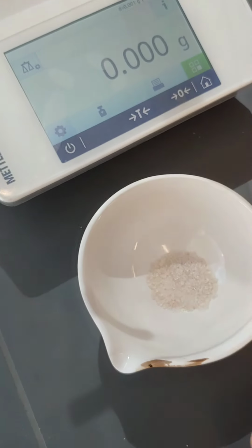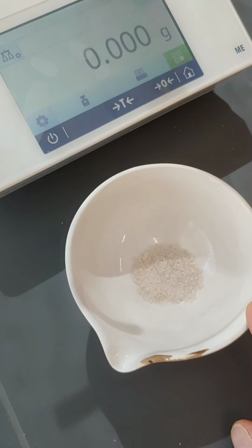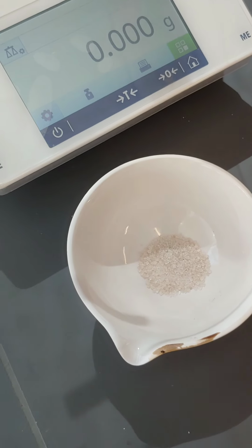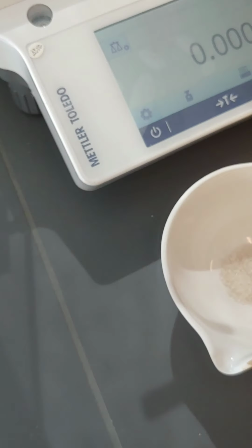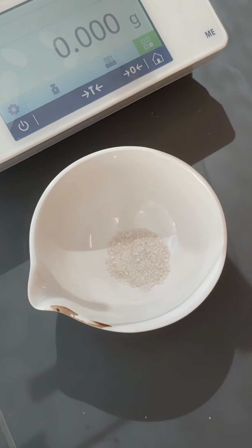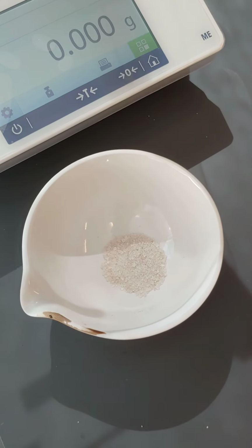Then I'm going to repeat that process a couple more times, adding more water, stirring, pouring off the water, adding more water, stirring, and then pouring off the water, because I want to make sure I get all of the salt out that I possibly can.